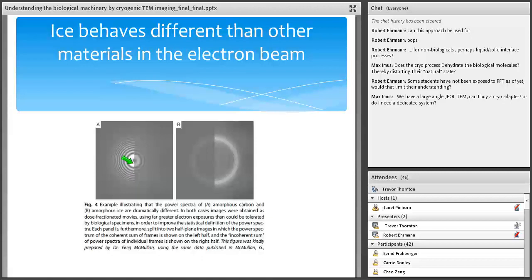The easiest way to think about that is when the electron beams refocus back onto itself to form a point, it doesn't meet in the same place depending on where the ray is coming from the electron lens. And that's because the electron lenses that we use are not perfect. And so they basically spread the beam out over a certain distance. In my microscope, that's 2.7 millimeters. And so you get an imperfect sort of image out of it.